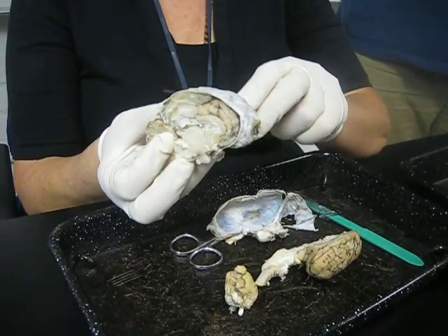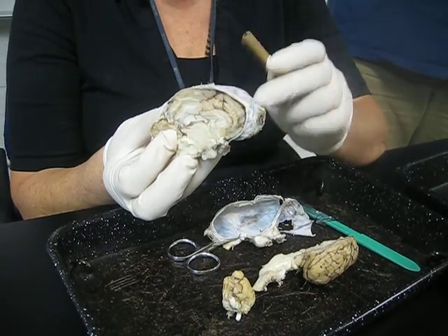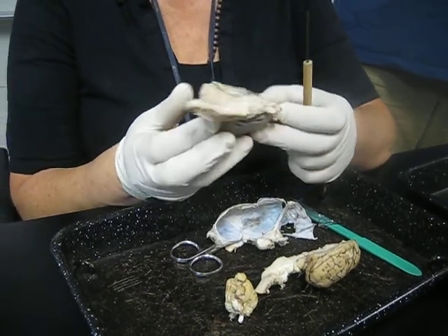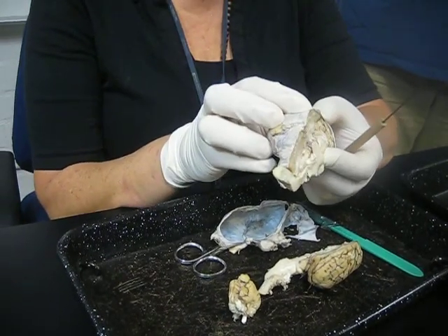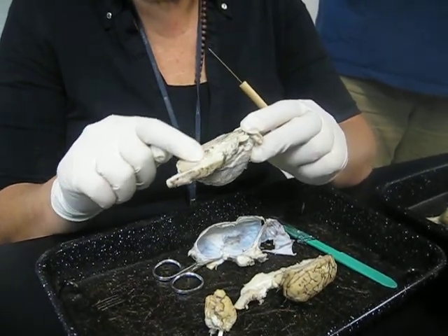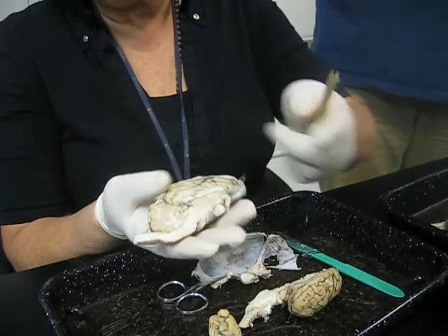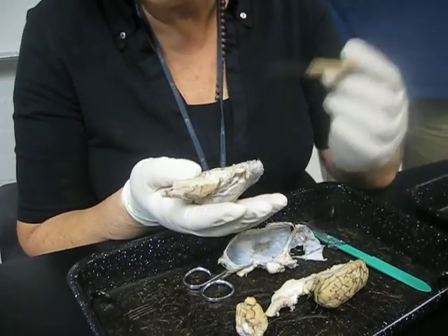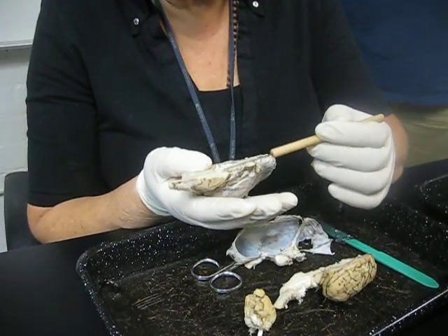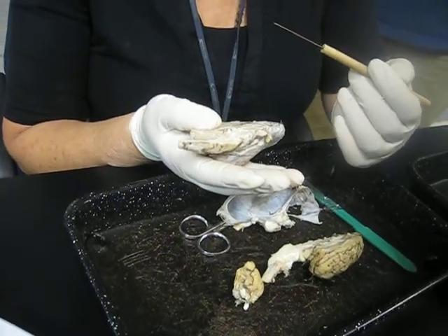Okay, so I have half of my cerebrum. This is a hemisphere. Is this right or left? Left. Right, it's pretty easy, right? So this is the left hemisphere of the cerebrum. This is the cerebellum. Once you've done a sagittal cut, the only way you can tell your pons and your medulla is by counting bumps. The first bump is the pons, the second bump is the medulla.